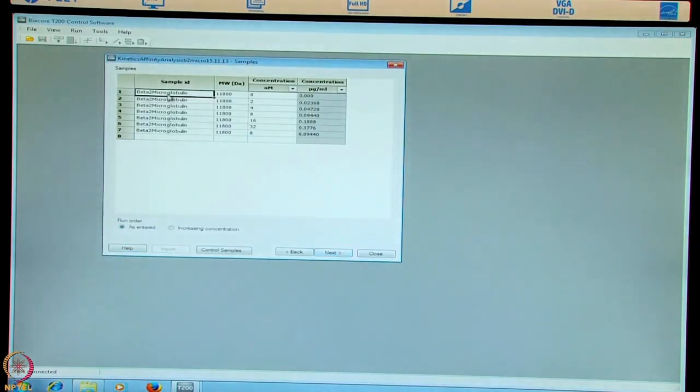And fill in the name of the sample as beta-2 microglobulin with a molecular weight of 11800. And concentration with 0, 2, 4, 8, 16, 32 and the repeat of 8 nanomolar again.